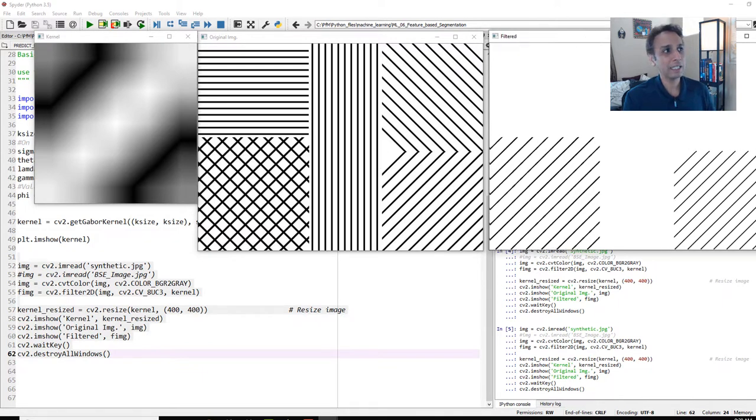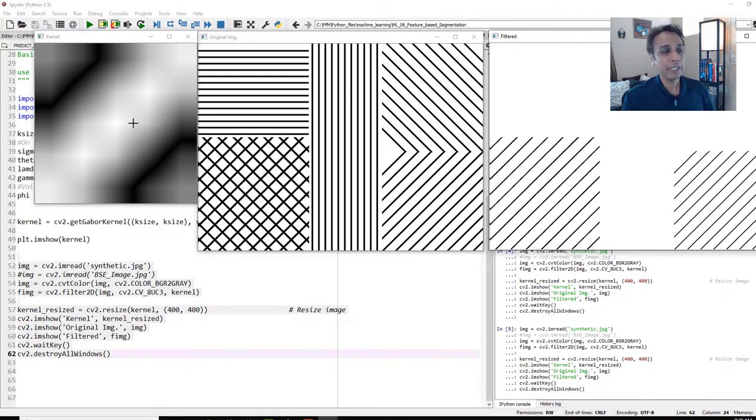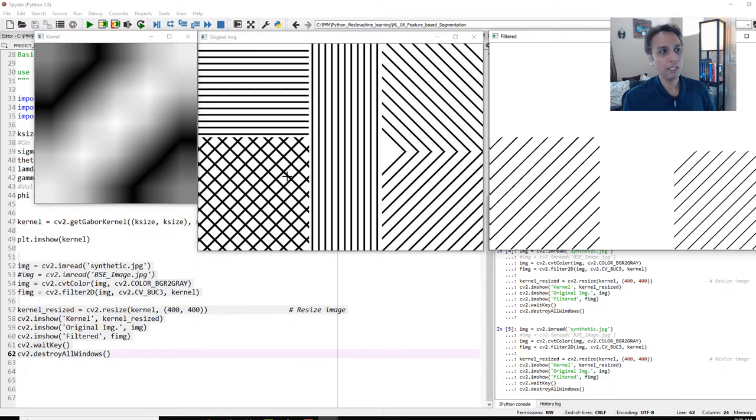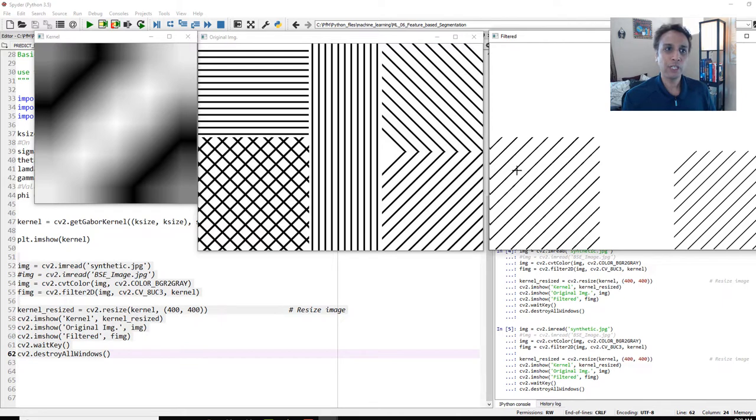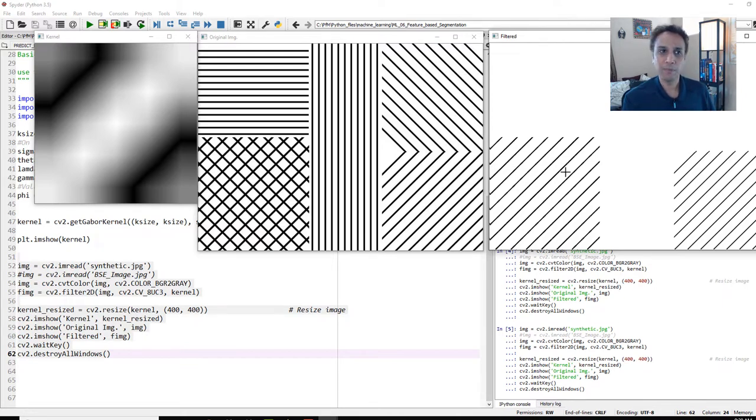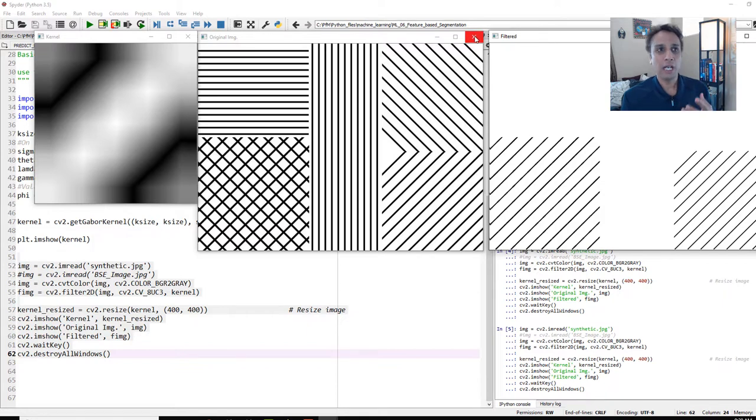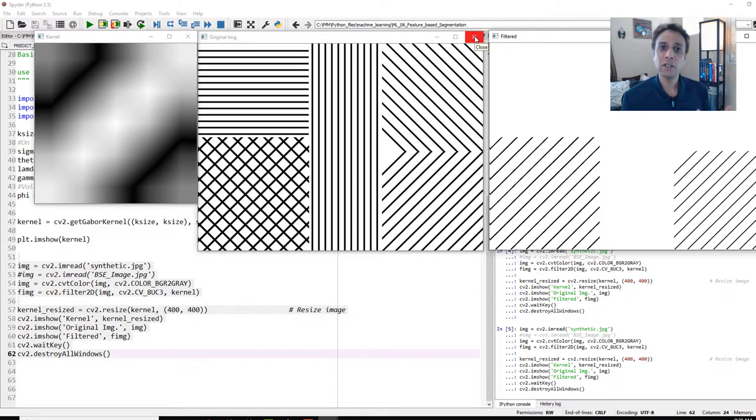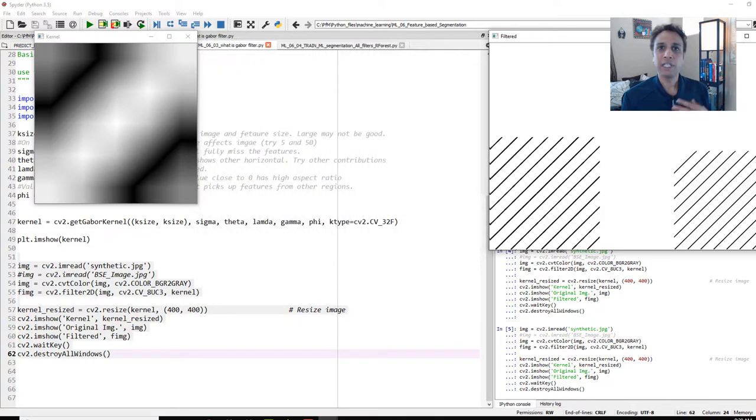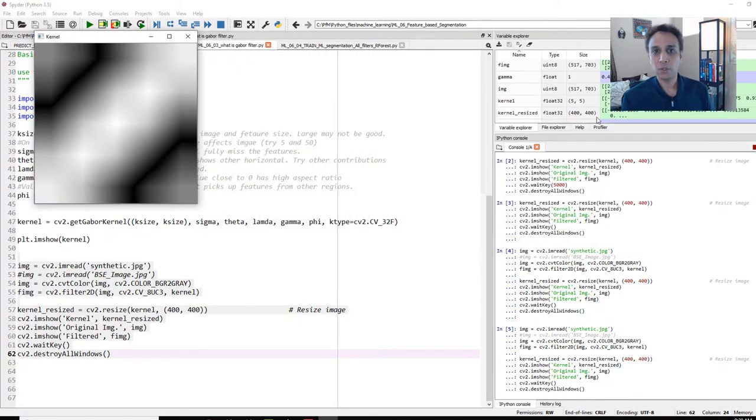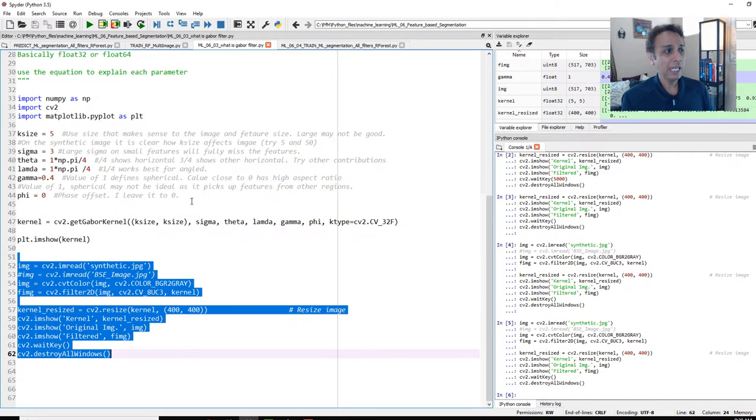As you can see, the digital filter is aligned along the 45 degrees or diagonal. That means it's like a bandpass filter. It's passing all the responses that are aligned in that direction and blocking everything that's not. So you can clearly see all these horizontal or diagonal lines over there. So you can imagine how powerful this is. And this is a great way of actually detecting texture, especially if the texture is aligned in a specific direction. But one filter is not enough.